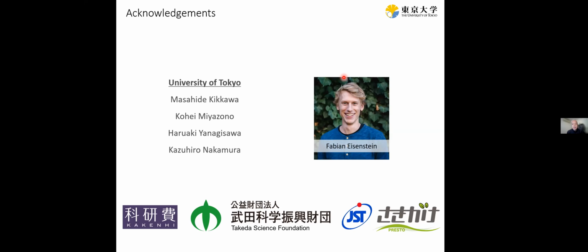Yeah, preferential orientation is the killer nowadays, I would say, for a well-purified particle. Even with the CGRP, there was preferential orientation. If you look at the maps, they definitely have an anisotropic resolution effect. There are a few solutions. One is to collect data with a tilted grid. We haven't tried that. I guess many people resort to that as a measure to resolve issues with preferential orientation. With the receptor only, it's already borderline in terms of whether it will reconstruct or not, as you probably know from processing these datasets. So tilting the grid may actually kill it. I don't know. We have to try.